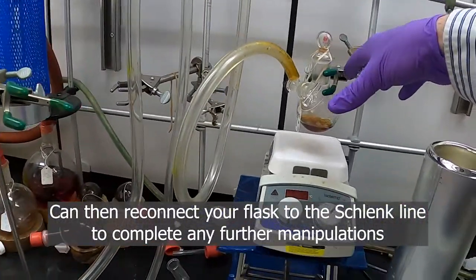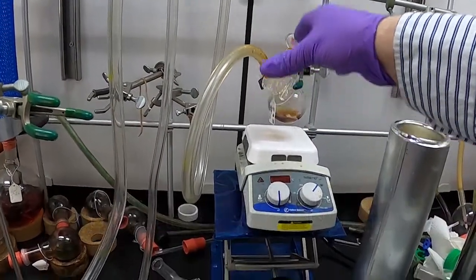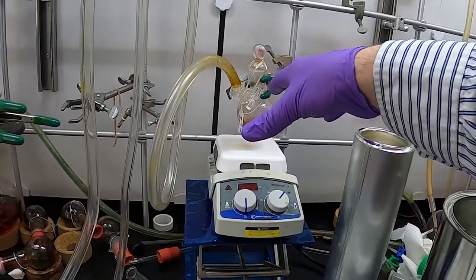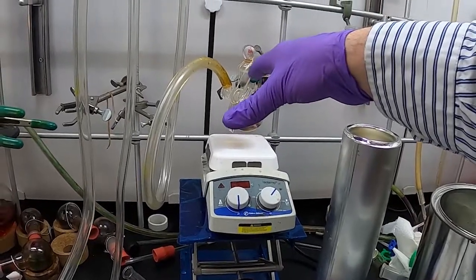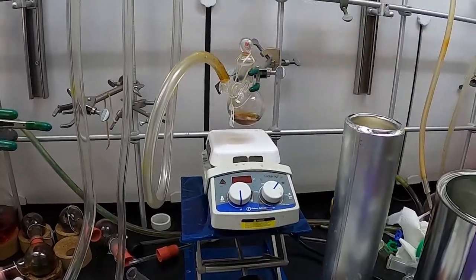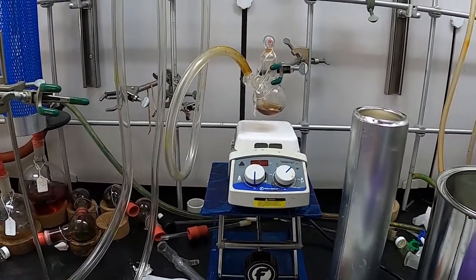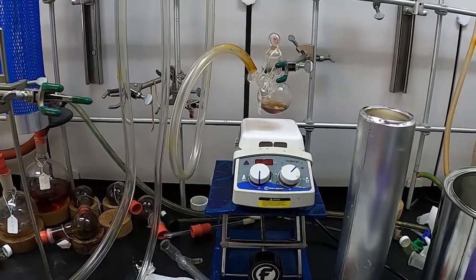If you want to put a septum on here for further manipulations, or if you're ready to take this into the glove box, make sure it's under vacuum. If you want to continue drying, you can do drying on the Schlenk line, and then make sure you're under nitrogen or vacuum if you're going to bring it into a glove box for any further manipulations. That's how to use an external trap to remove solvent on the Schlenk line. Please see other videos by Chem410. Thank you.